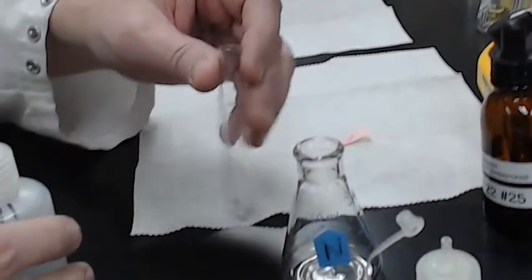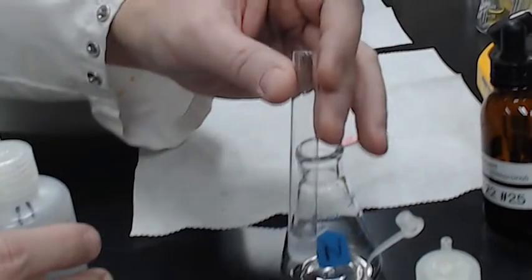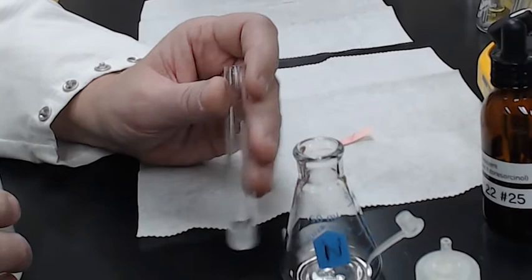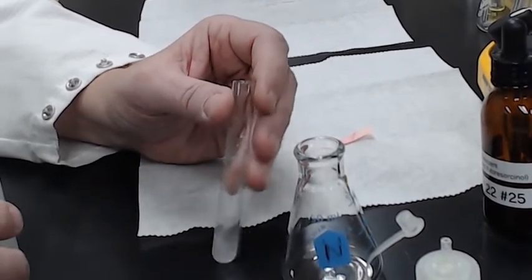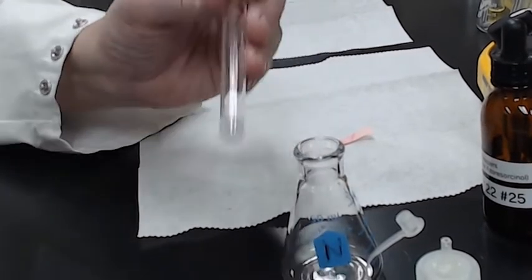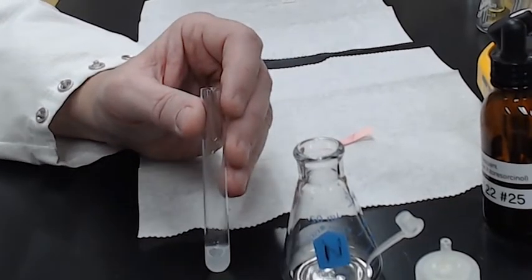It says mix and warm gently for 1 minute. Oh, actually it's starting to precipitate. So this is suspicious. Having a cloudiness means there's a high possibility of having magnesium in there. We're going to proceed as if there is magnesium in there, and to do that, we're going to do the magnesium lake experiment. Okay, so definitely cloudy. Hopefully it's magnesium.